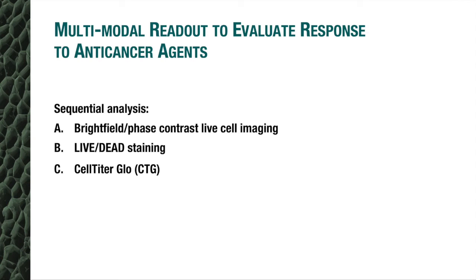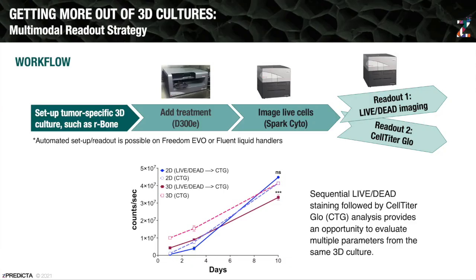So what we looked at is a sequential analysis looking at bright field or phase contrast live cell imaging, then looking at a live-dead staining, and finally CellTiter-Glo to quantify the cellular response to treatment. And this was all done utilizing a couple of Tecan instruments.